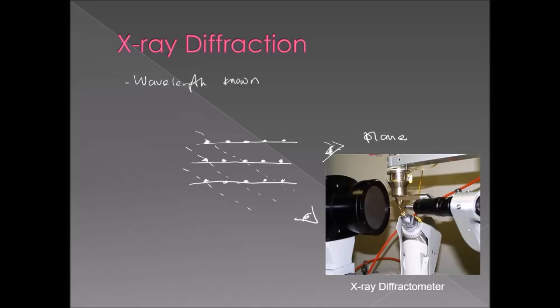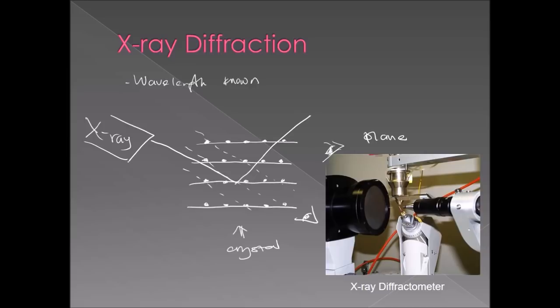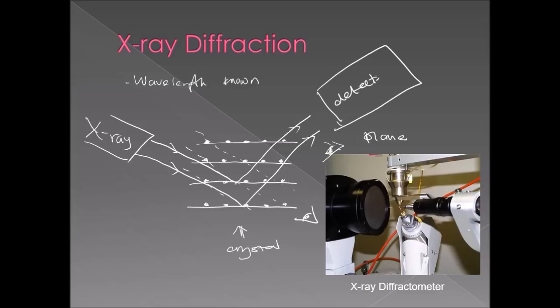And let's say we expose your crystalline material to X-ray. Here is the X-ray source; the ray will go down and hit the plane. When they hit the plane, they will reflect. They hit like this and reflect, and what has been reflected will be recorded by a detector.